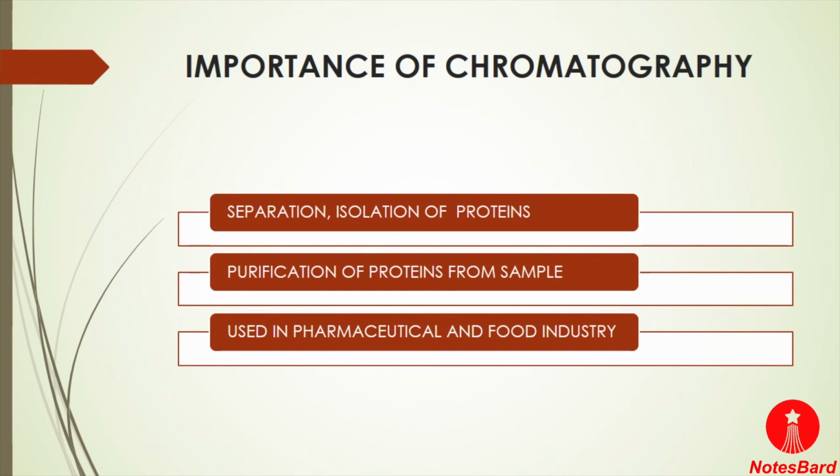So in this video we have discussed chromatography, different types of chromatography, and the importance of chromatography in the biological field.